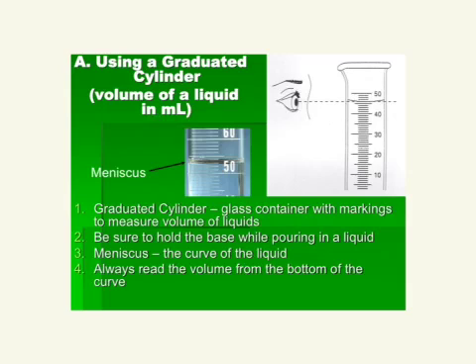Using a graduated cylinder. A lot of times in our classroom, guys, and maybe you've already done it or you're going to do it, you're going to be using a graduated cylinder. This is a graduated cylinder right here. Okay, this is what it looks like.